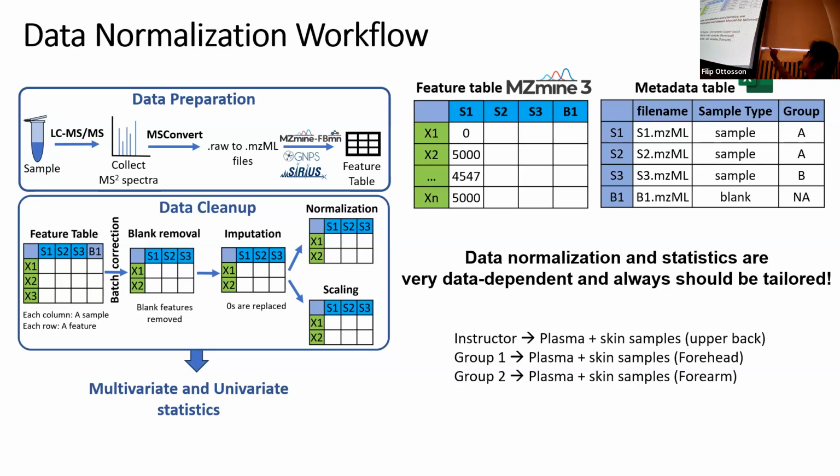And one more thing I have not added here is that it is also necessary to have an ATTRIBUTE underscore prefix. All this information is also available in GNPS. They have some rich documentation, and you just got to have this attribute underscore prefix on the attribute columns that you add.